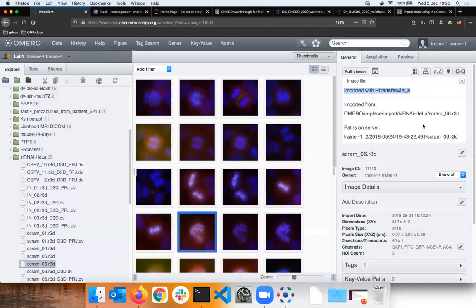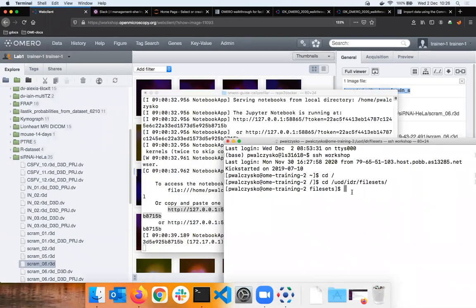And the way how to do that in the first place is something like you go into this environment, yeah, and run a command which looks like OMERO import and then you say LNS or something like that. Yeah, don't worry about the syntax. I'm not telling you the exact truth. Yeah, but something like that, and then you hit enter, and it will say you made a mistake.